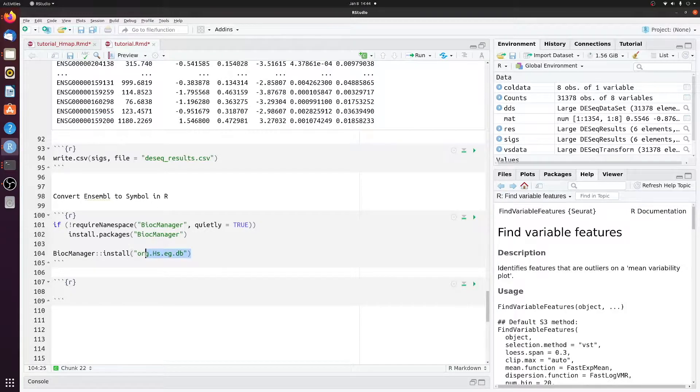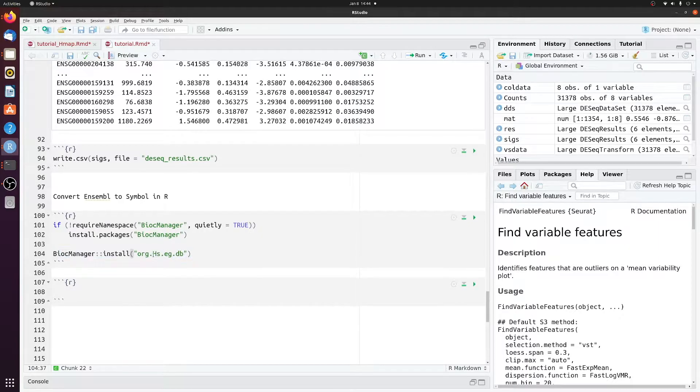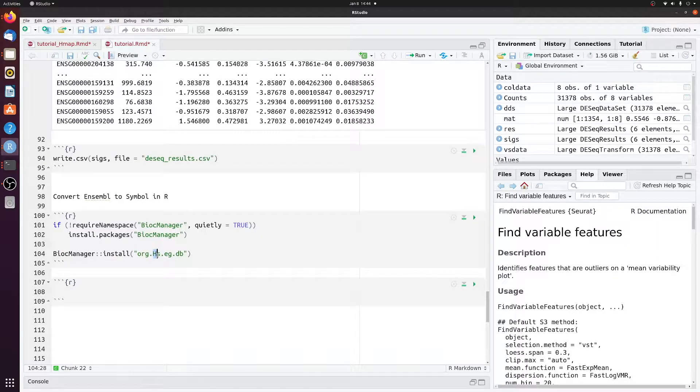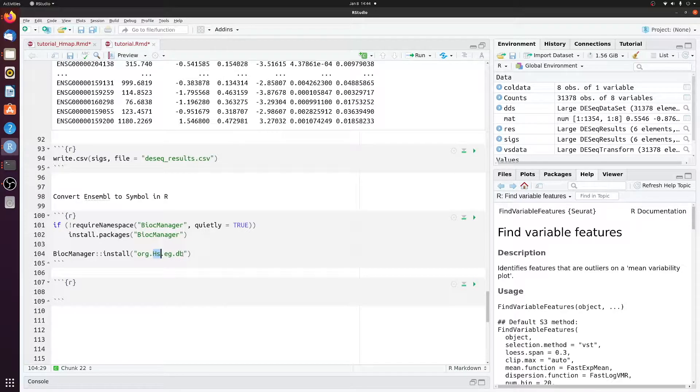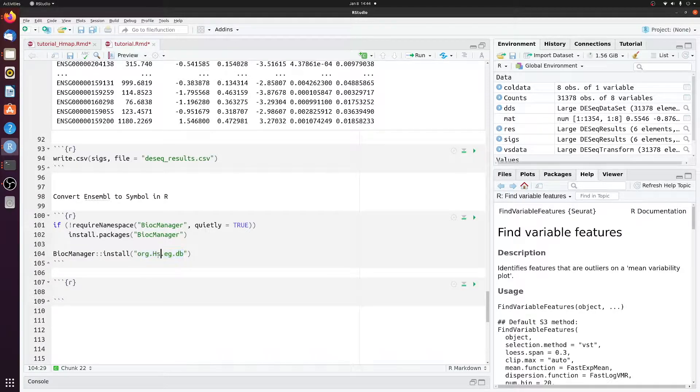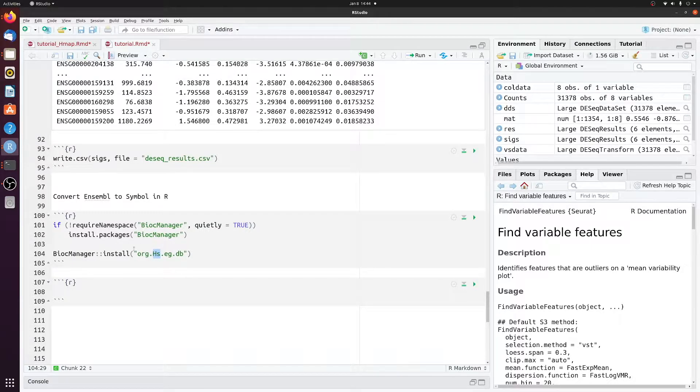The first thing you need to do is install the correct database from Bioconductor. In this case, I have human data, so I'm downloading the human database. If you had mouse data, you would just replace this HS with MM, but you can search for other organisms on the Bioconductor website.